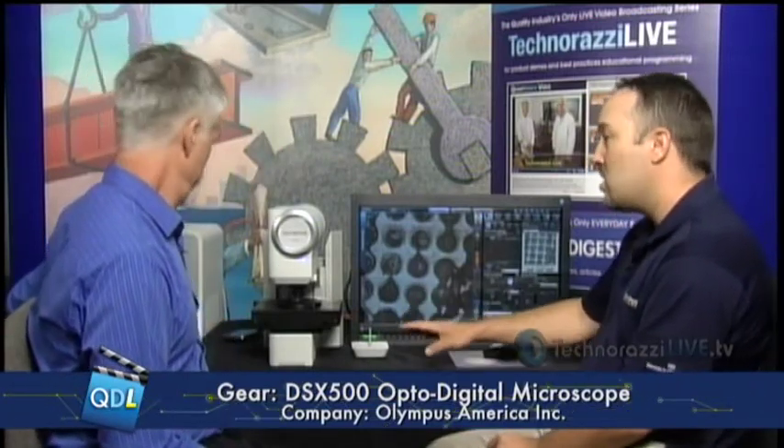This tool is designed to save you time and money through ease of use, to produce images and data that can be used to make decisions. Olympus guarantees accuracy and repeatability of the tool through an auto-calibration feature. The system comes with a standard and we can do auto-calibrations with a one-touch interface.